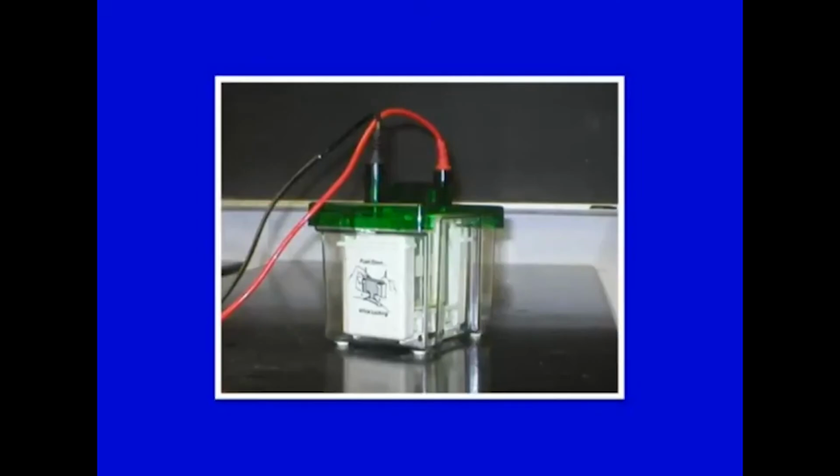Likewise, tube gels could be run in here, where rather than a slab gel or this plate gel, you will have a tube and only a single sample could be run. The whole apparatus looks something like this. You have an enclosed buffer chamber, and these are the electrodes, 2 electrodes here.